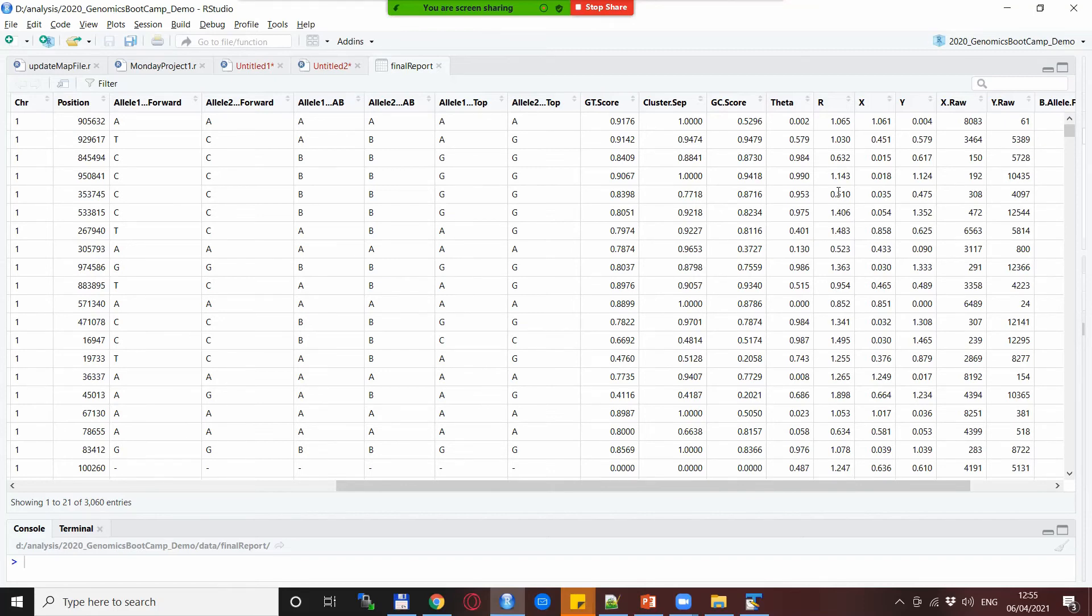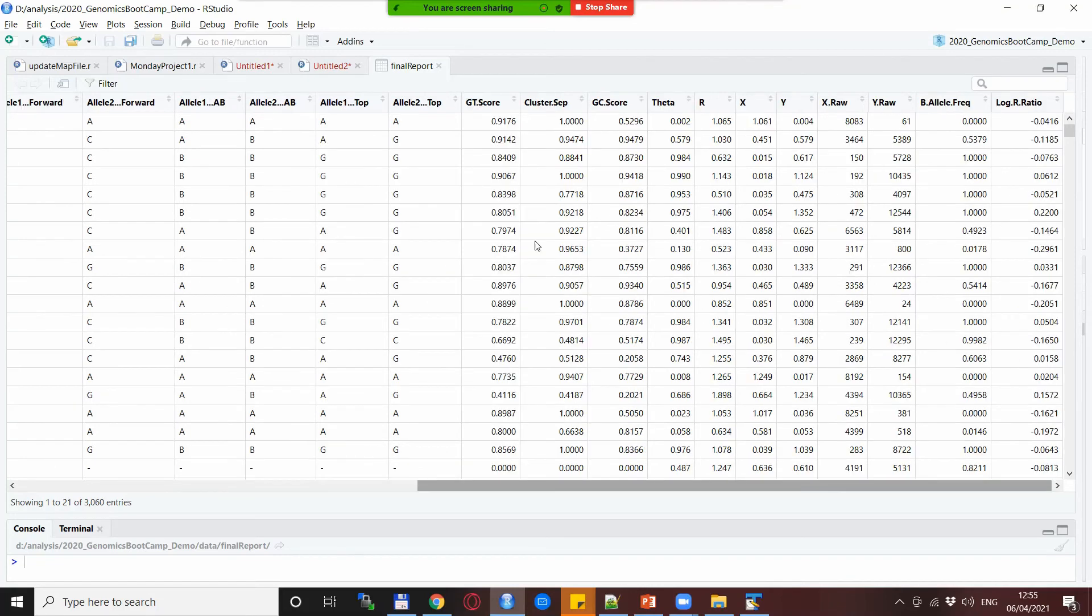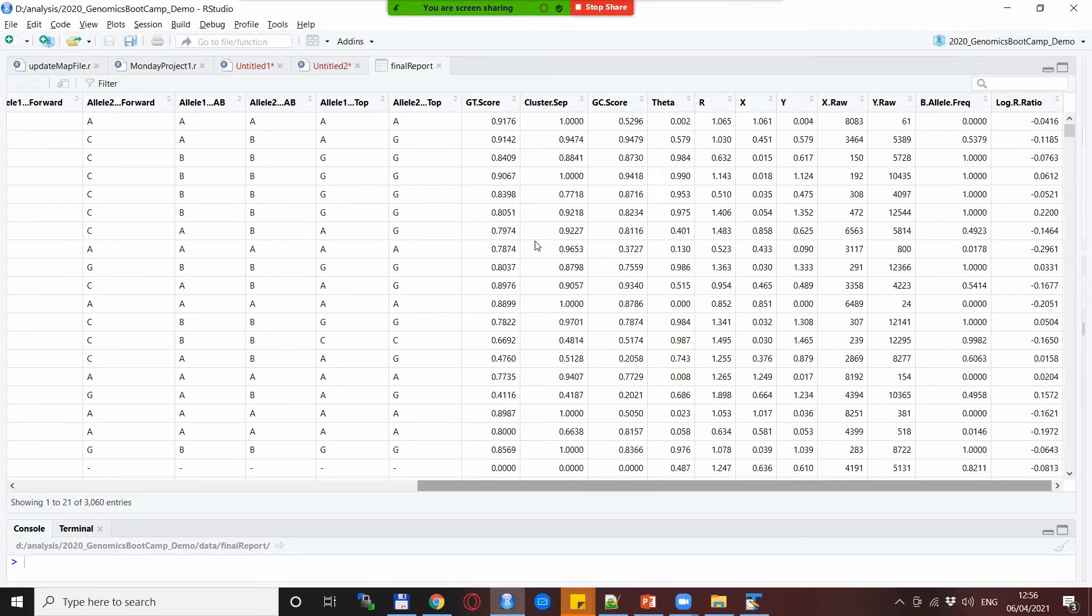But also there are some other metrics: theta, R, X and Y which are actually the metrics that are being used to create those graphs that we were seeing before.